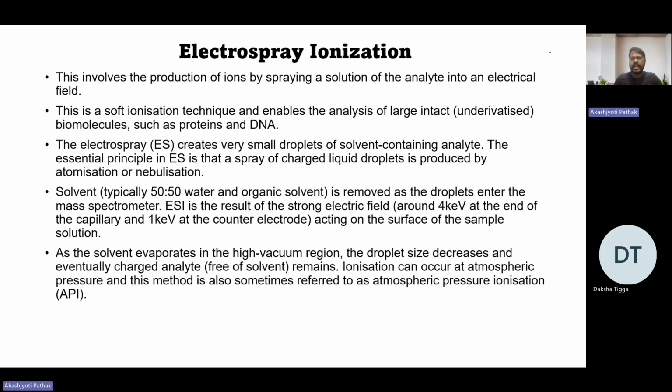So let's read the theory of this principle of electrospray ionization. It involves the production of ions by spraying a solution of the analyte into an electric field. This is a soft ionization technique and enables the analysis of large intact biomolecules such as proteins and DNA.